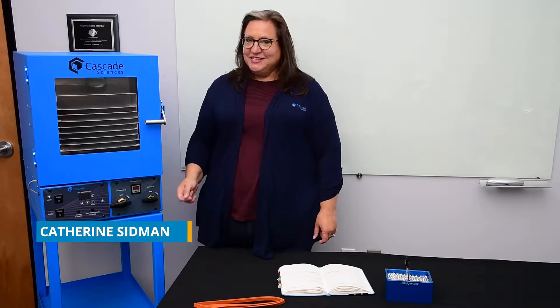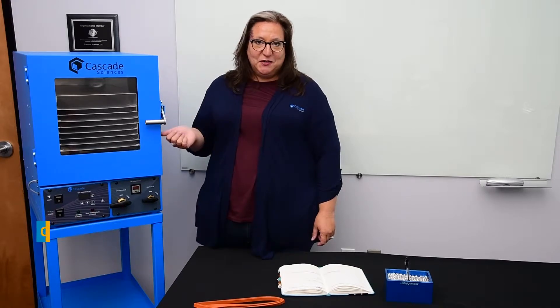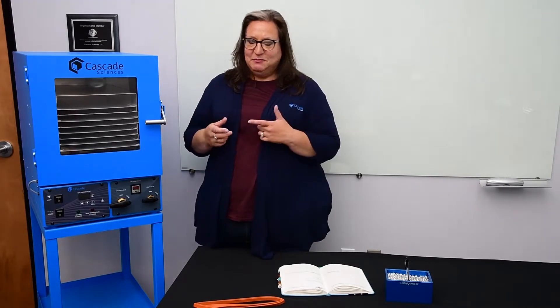Hi, it's Katherine from Cascade Sciences. Today I wanted to talk a little bit about the gasket that we use on our CVO ovens and routine maintenance.